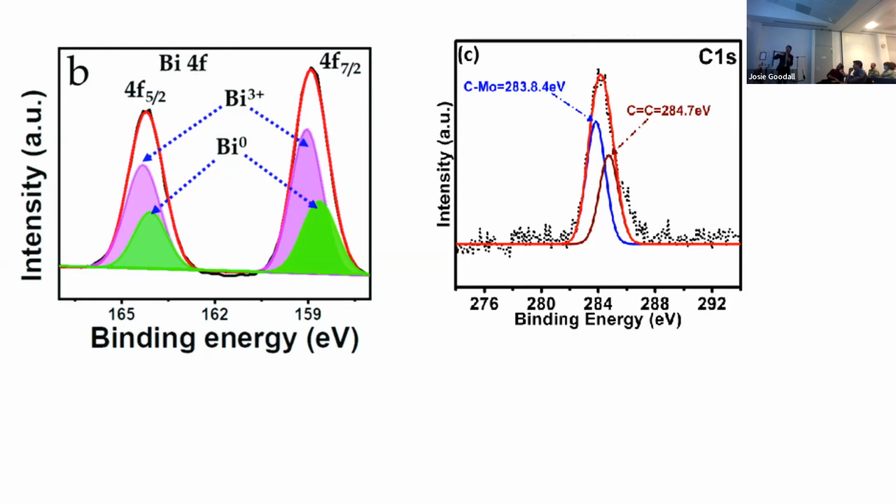On XPS fitting, if we focus on one region, how far can we change? Pretty much anything. There's no underlying atomistic model that will say, well, that doesn't make any sense because of whatever governs XPS. So it just doesn't work. I don't know if that's the kind of thing you're actually thinking of. So I guess there's still an information content argument, but it's complicated by whether you've got standards or not there.